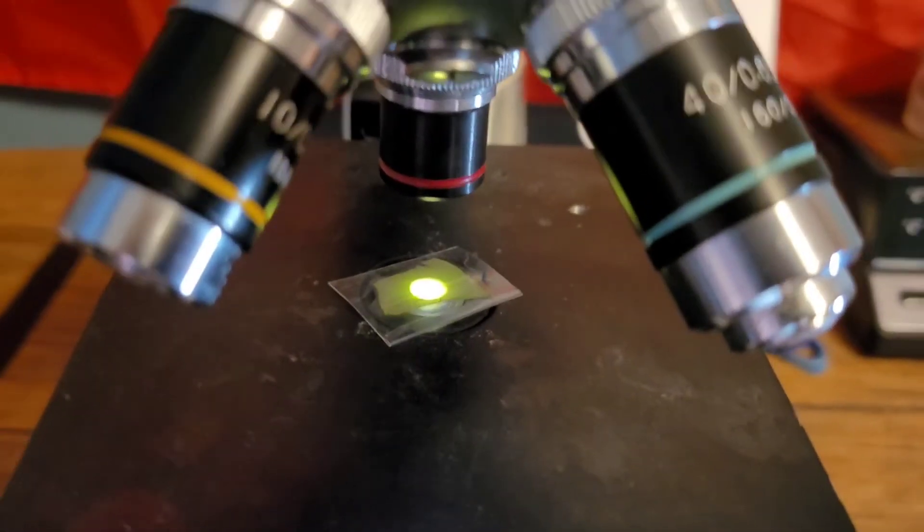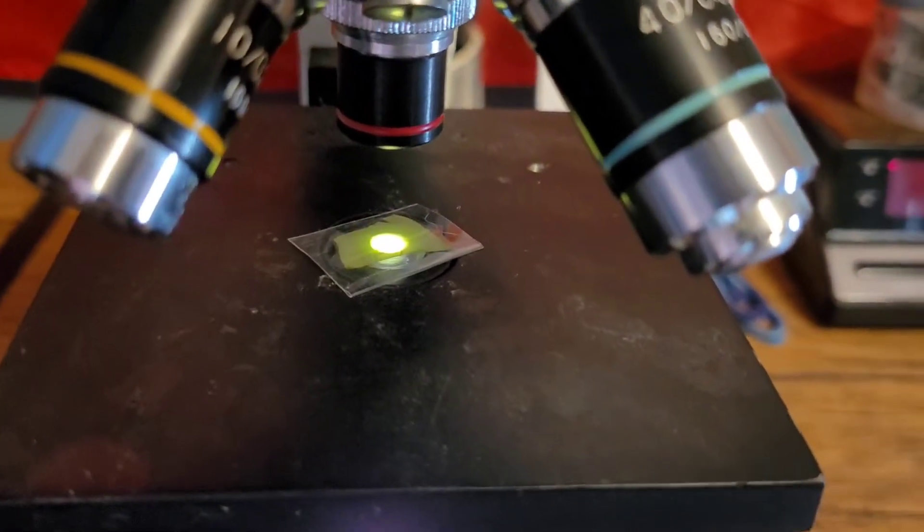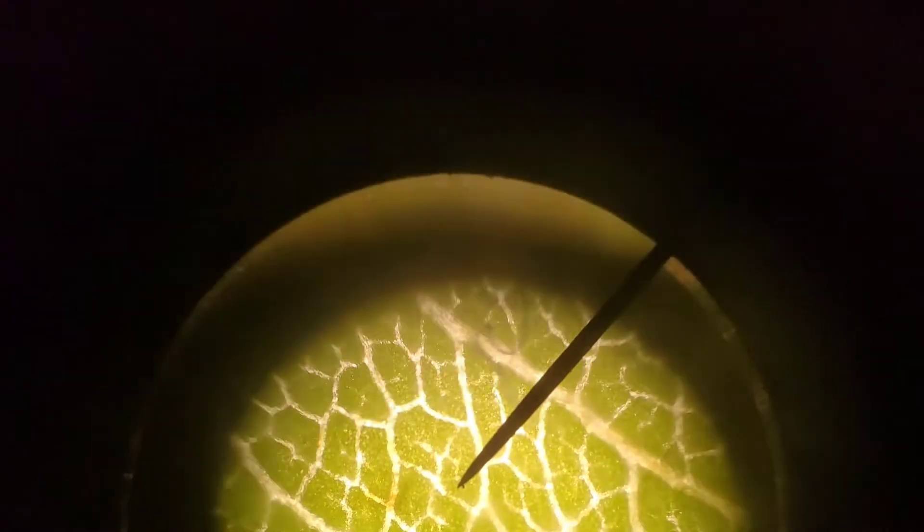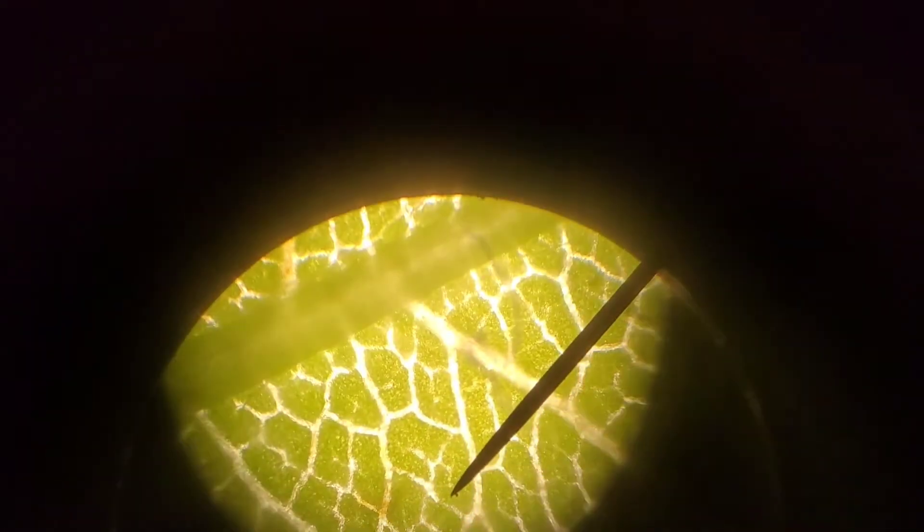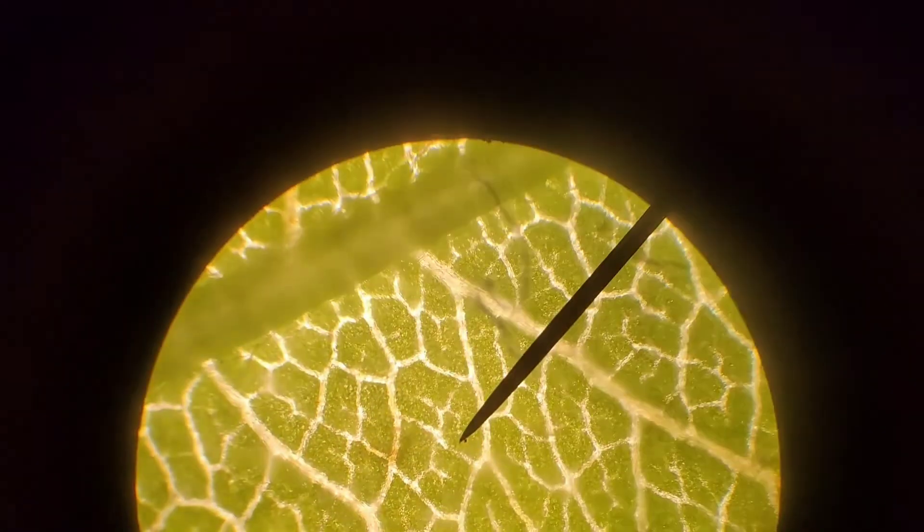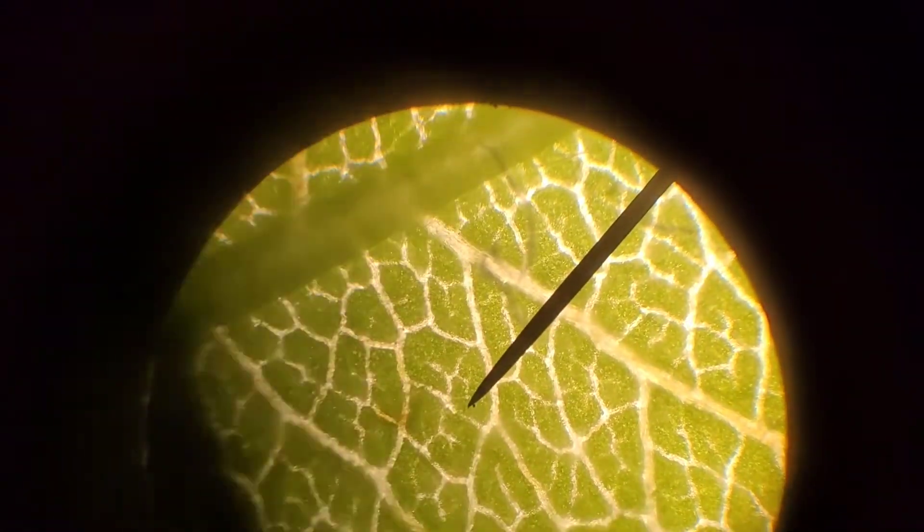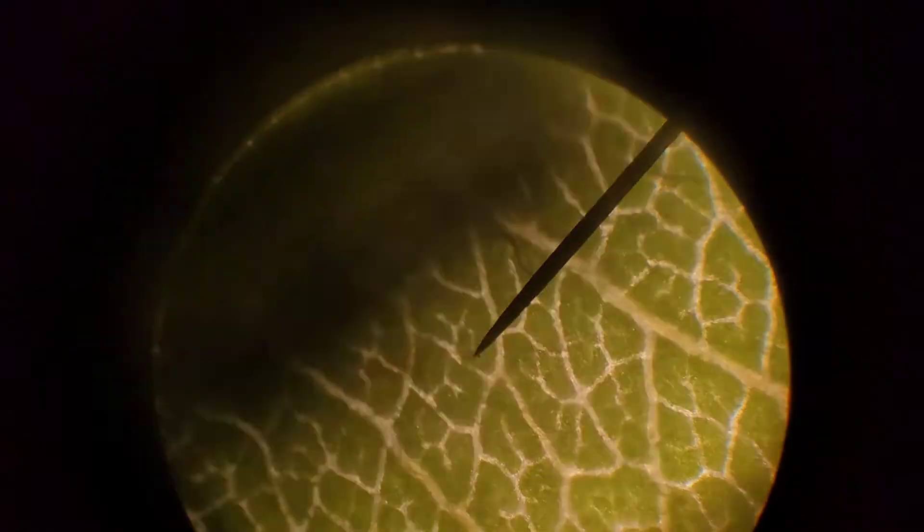Alright here's leaf two, this is part of a dandelion leaf. So here's the second sample. You can see the stem over there in the corner. There's like a hair on the screen, or on the leaf, a little bit of debris I guess.